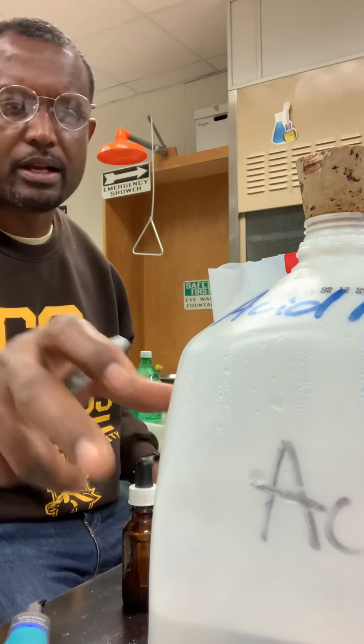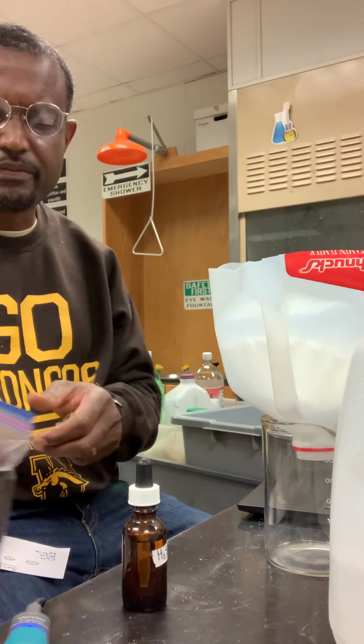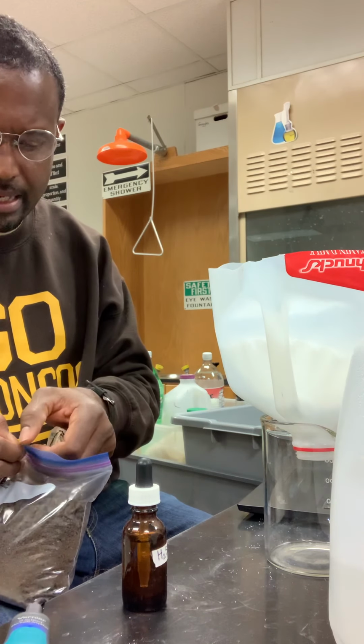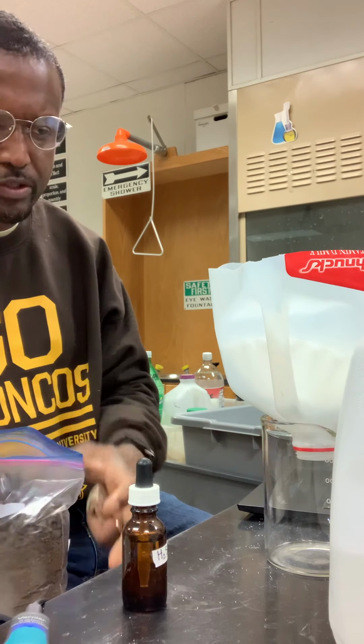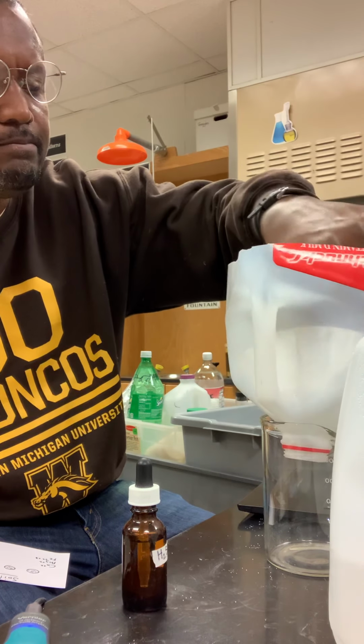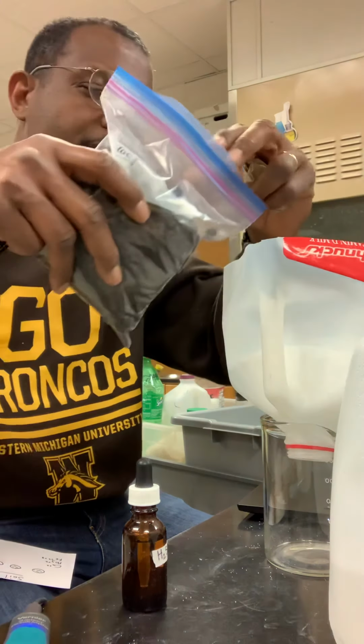And then we'll prepare some soil. There's some soil here, and we're going to put 50 grams of it in a half gallon milk jug with a coffee filter. So pour soil in.